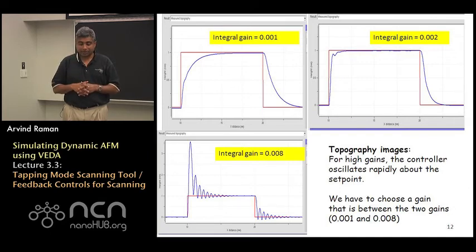And what we find is that if one tries to improve the ability of the AFM to track the exact surface, if we try to focus on that a little more we find that if the integral gain is increased to the control gain increases to .008 then we actually get a controller instability.